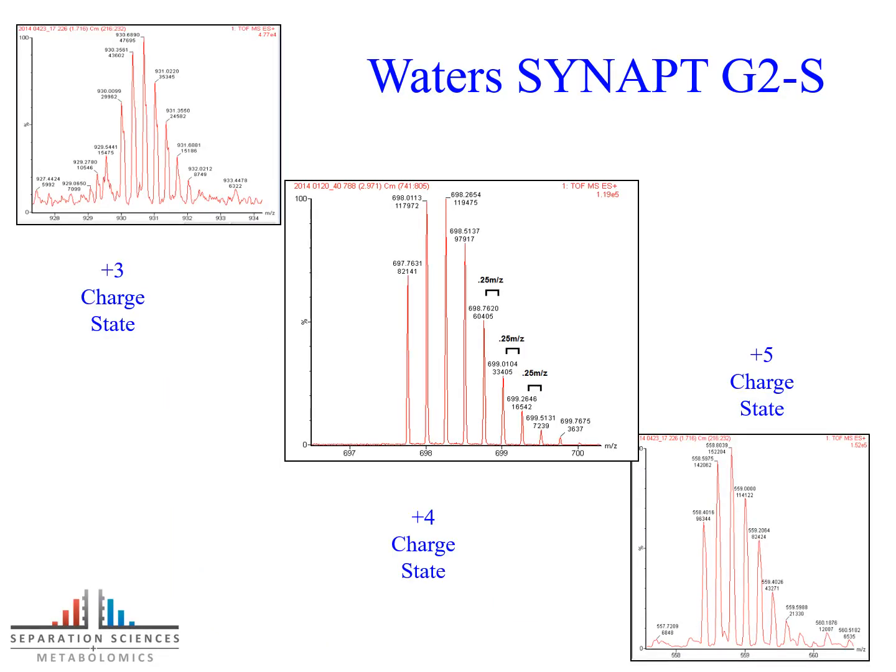Now, in addition, this shows the expansion associated with the +3, +4, and +5 charge states, and we can certainly see that for the +4 charge state, we have really nice signal to noise and baseline resolution.